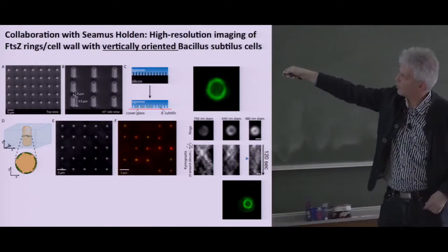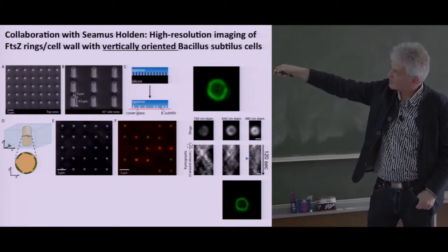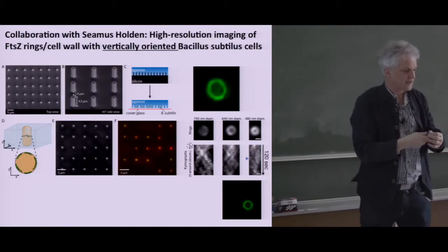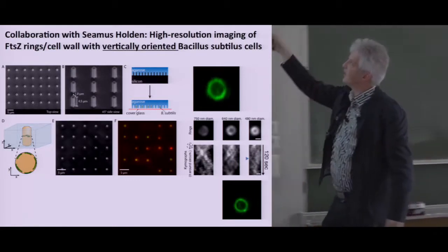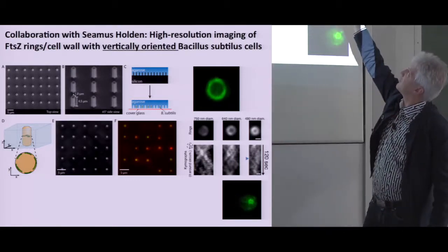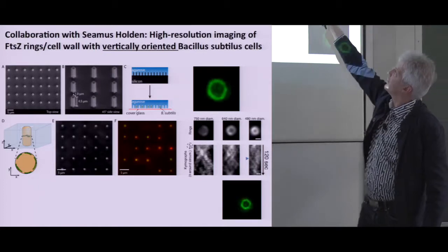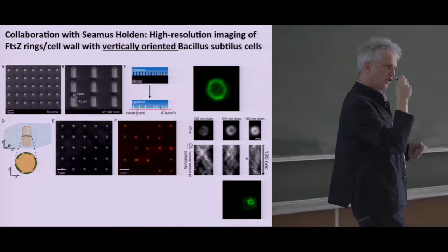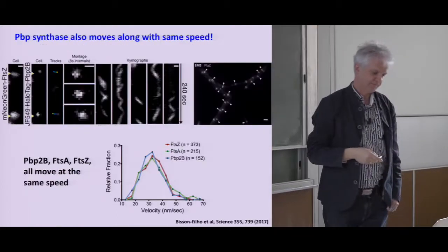On the short time scale, on the long time scale, you can see this large ring slowly contracting to small rings like that, which is kind of nice. And from kymographs, you can see lines of these kind of protrusions going along the ring, which are just straight lines, showing that there are objects walking along the circumference of this bacterium.